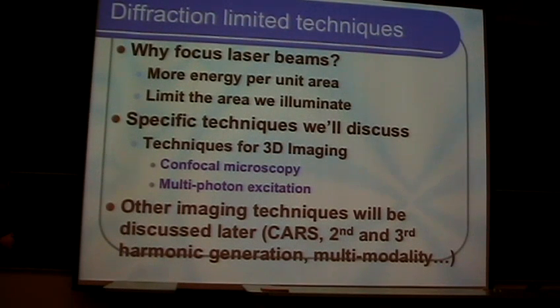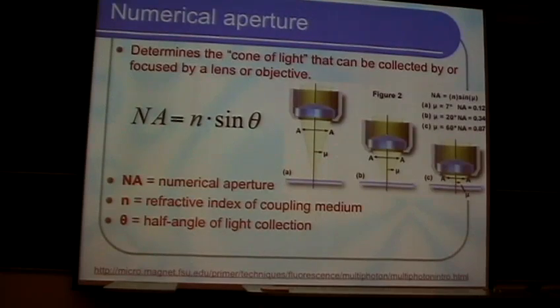In addition to confocal and multi-photon microscopy approaches, during the ICAM summer school, you will also learn about other 3-dimensional optical imaging techniques, including coherent anti-Stokes Raman scattering microscopy, second and third harmonic generation, and multi-modality imaging techniques. Those lectures will be given later on during the summer school.